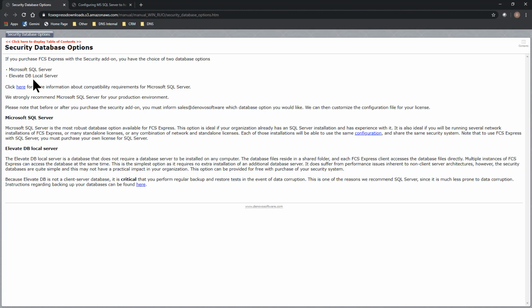Okay. What we also do is we offer the ability to have more of a local database. And this is a folder-based database option where within that folder there are different files that manage various aspects of the database, like the user list or the events or a lot of the information that's recorded as part of a session. Okay.